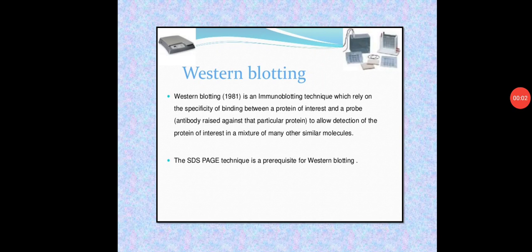Hello students. In this lecture, we will discuss our last blotting technique, that is Western blotting. In the last two videos, we have discussed Northern blotting and Southern blotting. So in this lecture, we'll focus on Western blotting. Western blotting is used for detection or analysis of protein.